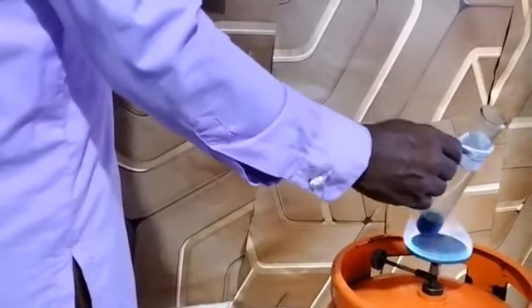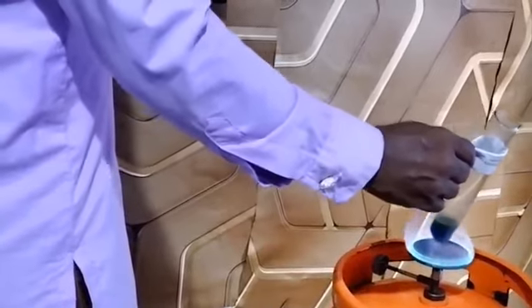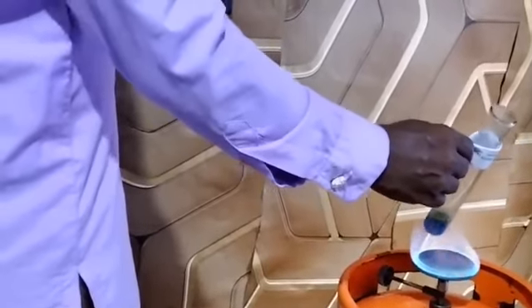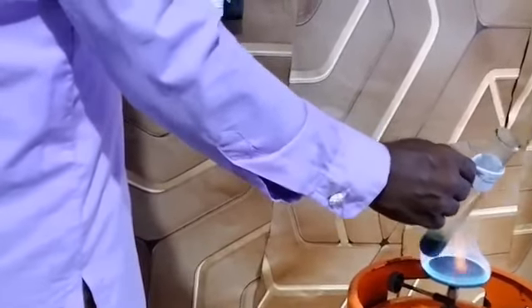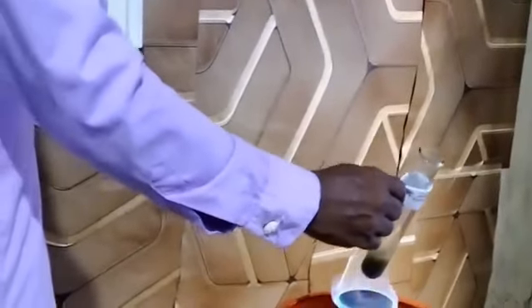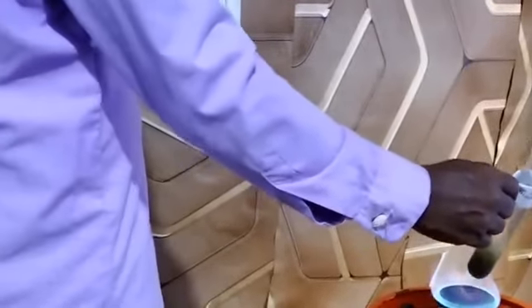Don't keep it in one place so you don't burst the boiling tube. Move it over the fire. Keep it slanting away from your face and also away from your neighbor's face.